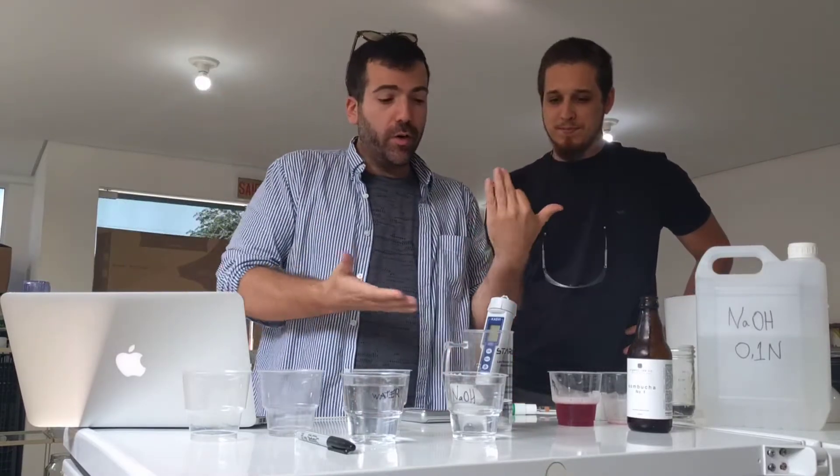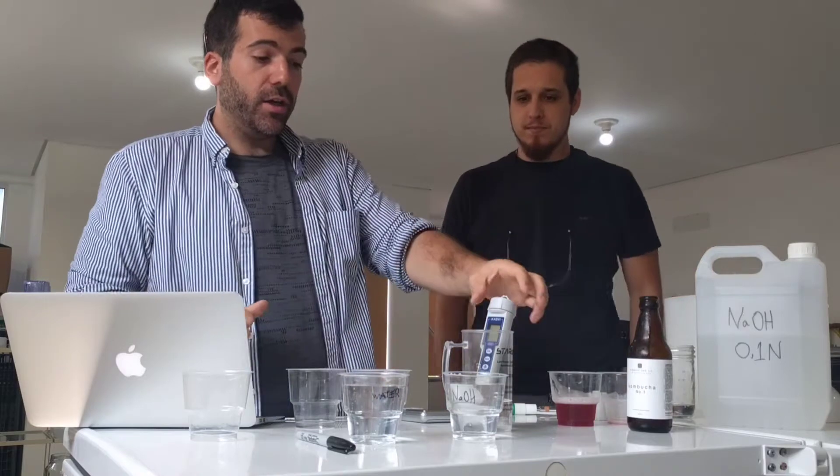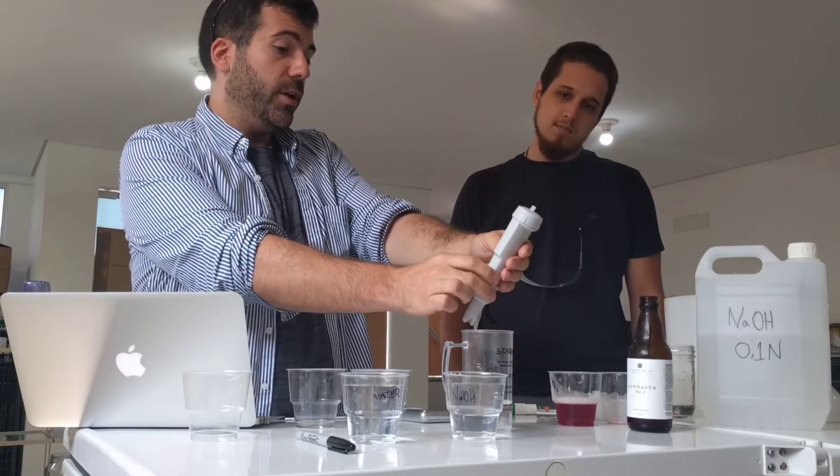So the way I do it is by weight. We're gonna weigh the container, then we're gonna be adding a little bit of kombucha, a little bit of water, and then adding NaOH until we get a pH of 8.2. There are different schools of thought — some people titrate till 7, some people titrate till 8.2 depending on what you're doing — but we're going to titrate to 8.2.